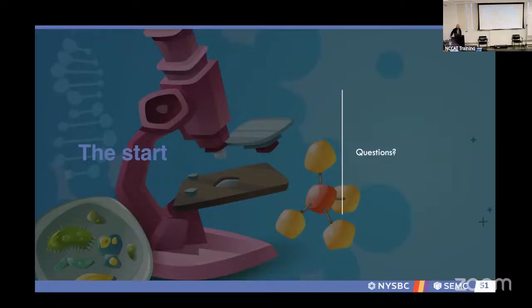Is there any physical restraint that prevents the microscope from sitting in this direction instead of this direction? There are electron microscopes that are more horizontal than vertical. There is the HEXI project at Diamond, where they'll build a lateral microscope. And I guess space requirements, if we had a nice high tension tank, could we stack up an electron microscope? I don't know. That would be great for space saving. So you don't necessarily have to have an electron microscope vertical.